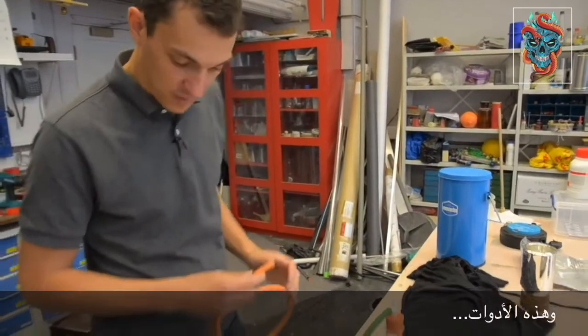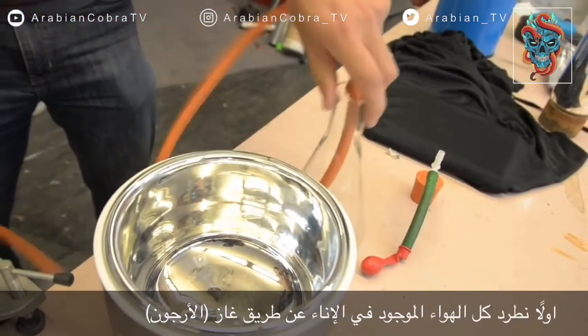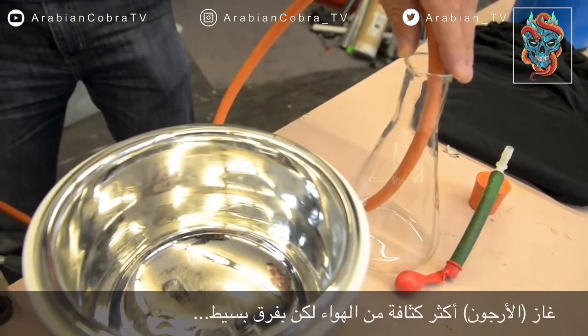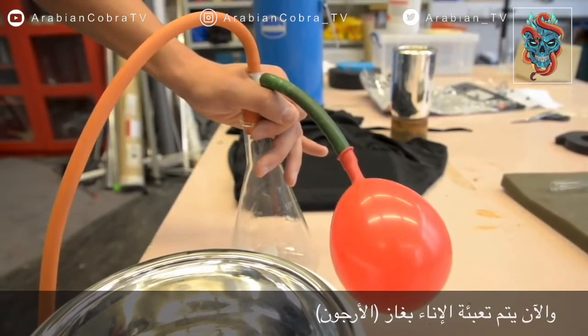This is my apparatus. First things first, purge all the air from here with argon. It's a little bit denser than air so it will just sit in here. This flask is basically full of argon — just inflate the balloon a little bit.